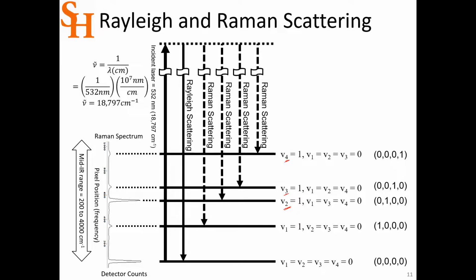So also, the Raman spectrum, maximum y-axis point is around 10,000, sometimes 15,000 counts. So that's the number of photons that are hitting our detector. And the infrared spectrum is in attenuated reflectance. It's kind of like absorbance. And that's going to be like 0.5, maybe 0.7. And so if you plot a 0.7 peak on the same scale as 10,000, your 0.7 is going to be undetectable.